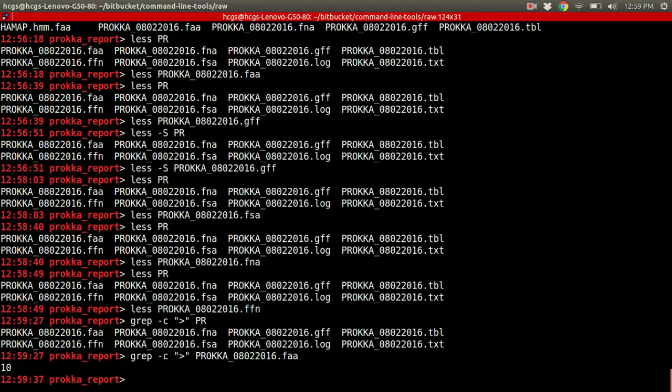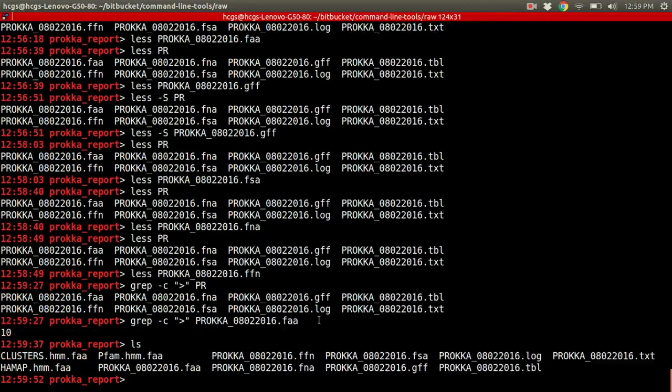So those are the primary things that you should worry about. These are the files that you will get back from Prokka. And this is what you're going to be wanting to analyze. There are also some programs, I believe, that will take the GFF file and help you visualize it, but that might be outside the scope of this video.